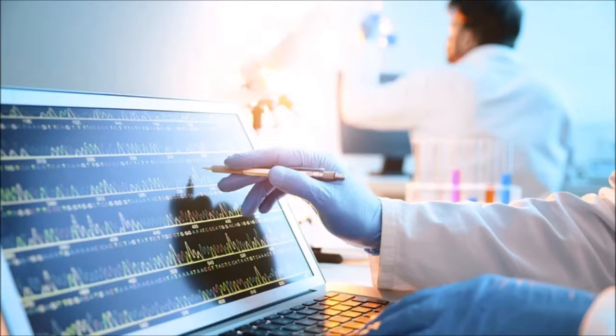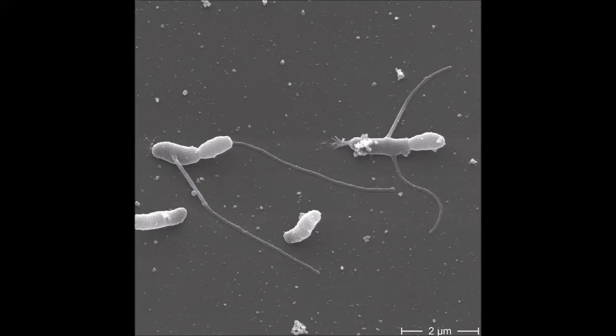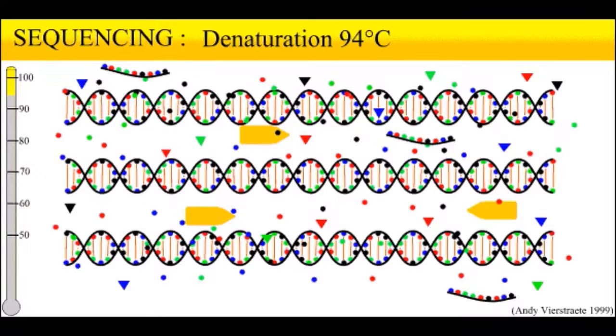DNA sequencing techniques are of great importance in the fields of medicine and biology. Identifying DNA sequences aids in the process of research, especially in biological fields. Further, there are specific fields where DNA sequencing is of extreme value. Firstly is the medical diagnosis. Secondly is the virology. Thirdly is the forensic medicine. And fourthly, the biotechnology. The process of DNA sequencing is divided into 3 major steps.